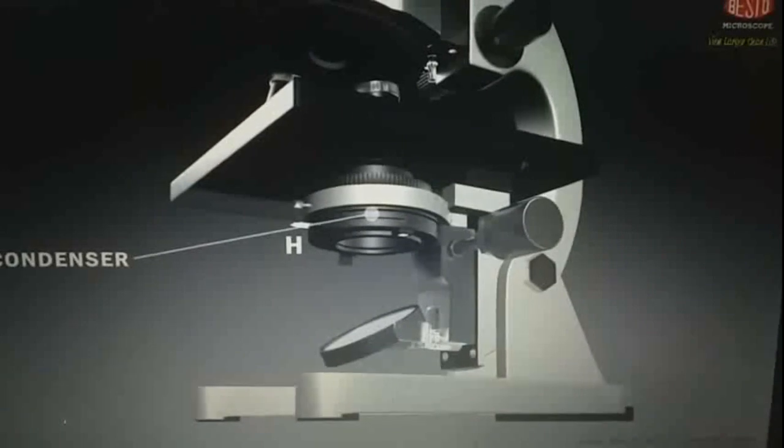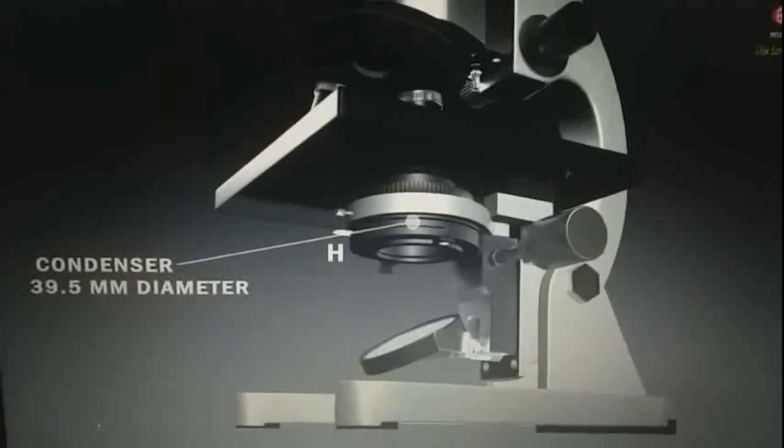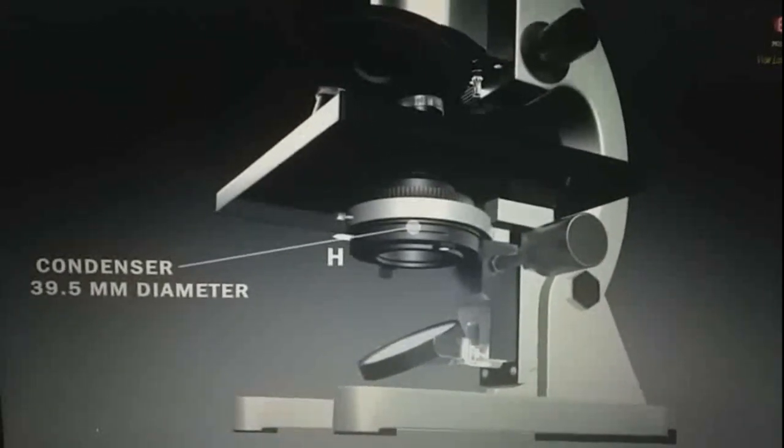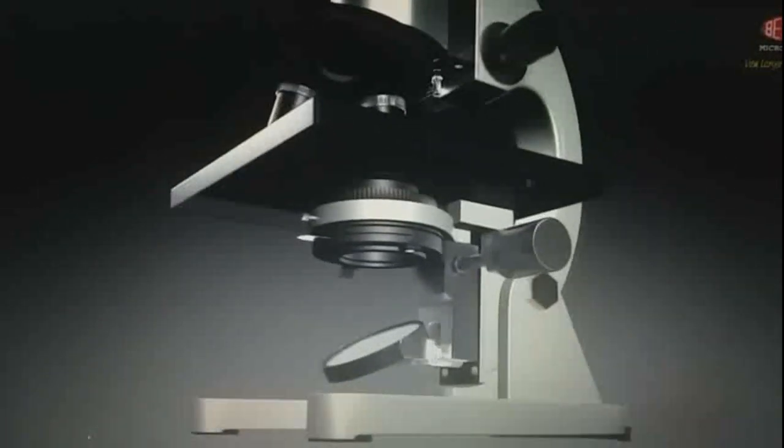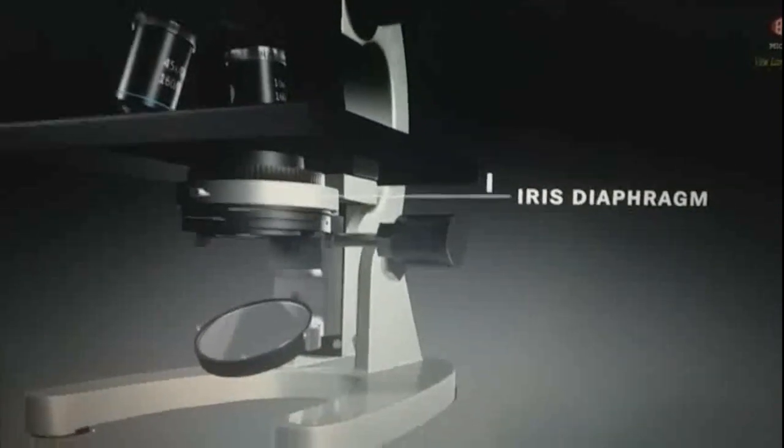H, condenser. Beneath the stage microscope have a condenser having standard diameter of 39.5 mm which collects and concentrates the light before it passes through the sample.